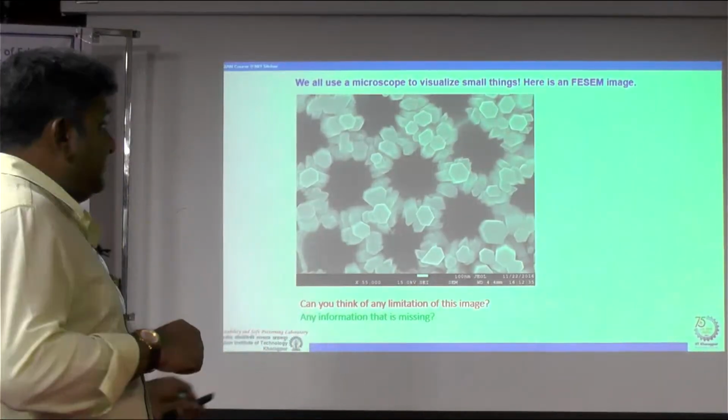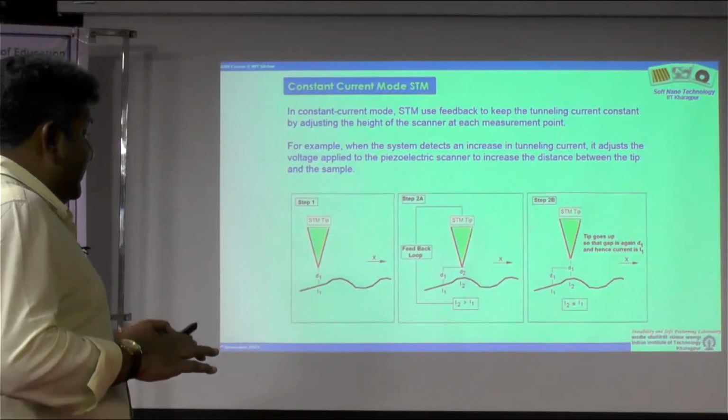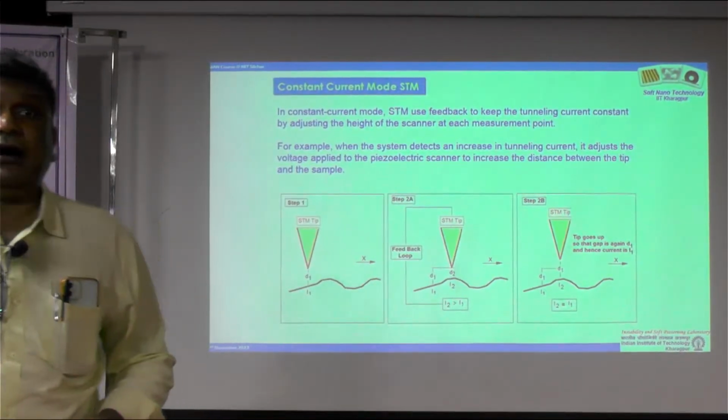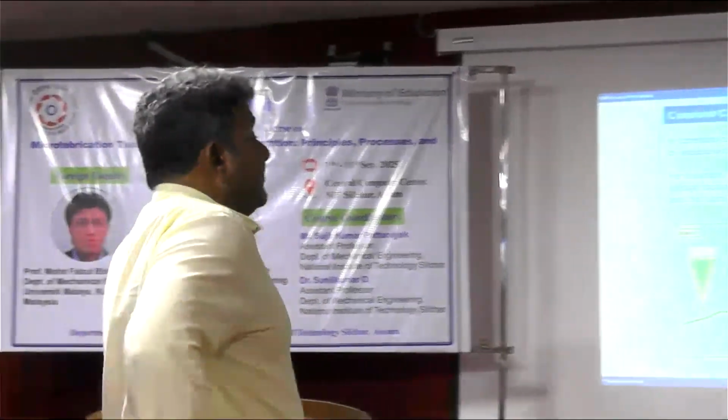But this very simple thing, which is not simple actually, what I talked about, with that, if you now trace the surface in a digital way, you now actually know how high or low they are. So you are already getting information about the third dimension, which was otherwise lost in a regular microscope.